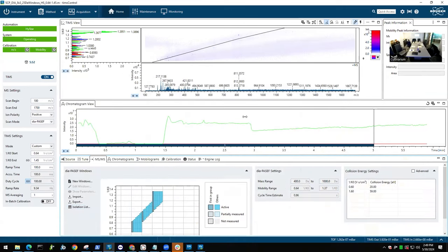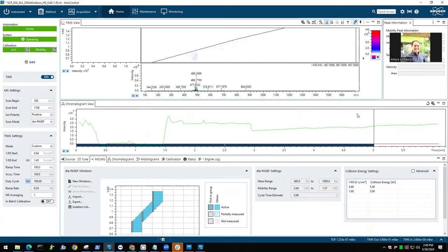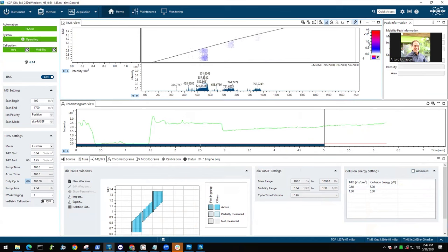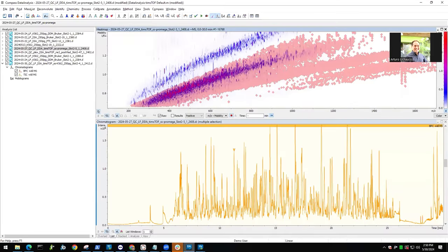And to visualize this, what I just do is reduce the collision energy here and switch from the MS to the MS2 mode, and I'll make it a bit more visible. So this is what is being isolated in the 25 Dalton windows that we select at different ion mobility ranges. Right now it's without collision energy, that's why you only see signal in this range. Just to visualize that we are mimicking what we see here. This is how the mass spec scans through. And when you see the trajectory here, it's the same slope as where we have our molecule here, that we follow this trajectory.